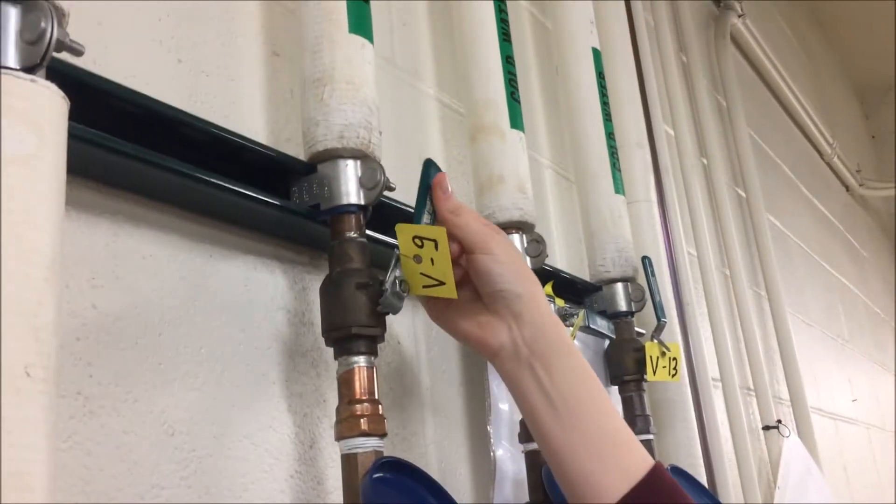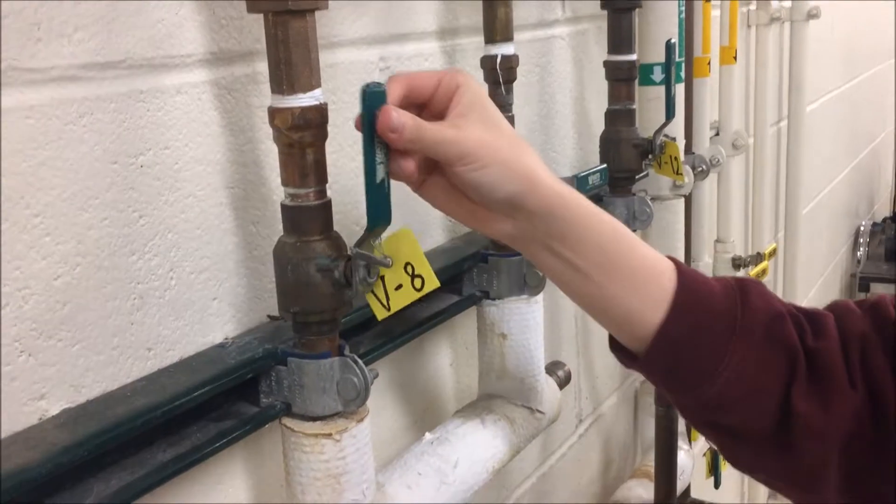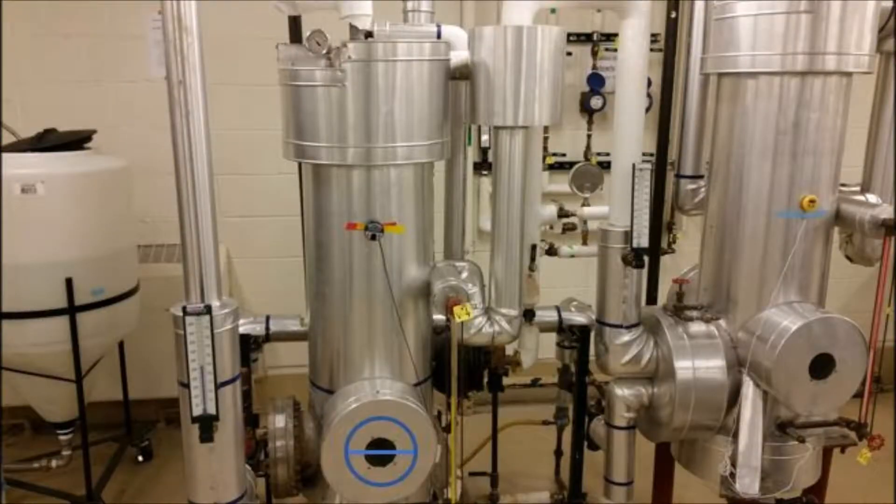To fill effect A with water, open valves V8 and V9. These valves will remain open the entire operation as effect A has a regulator. Ensure at all times the water level is somewhere between halfway and the top, but never above the front sight window.